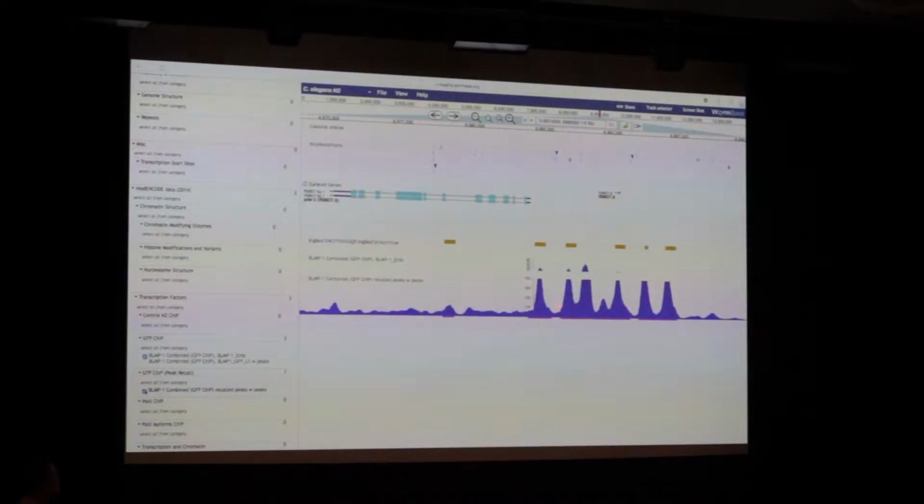It means I'm probably remembering correctly what this big bet is. But a couple of things I want to point out about it that are, oh boy, hard to see. But relatively new to this JBrowse instance, like in the last release or two, for modENCODE data that has peak calls. These little pink bars here are peak calls. And unfortunately, there's some really nice pink highlighting that goes along with it, but you can't see it, I'm sorry.